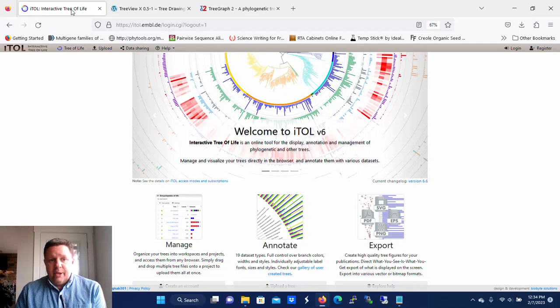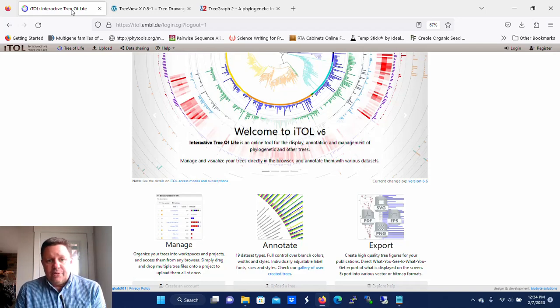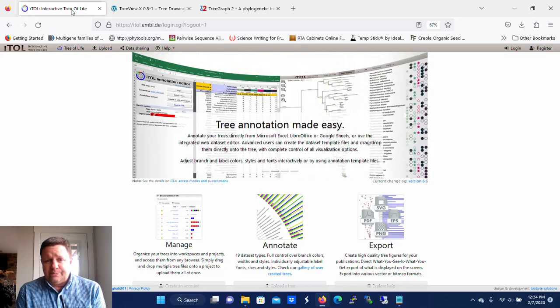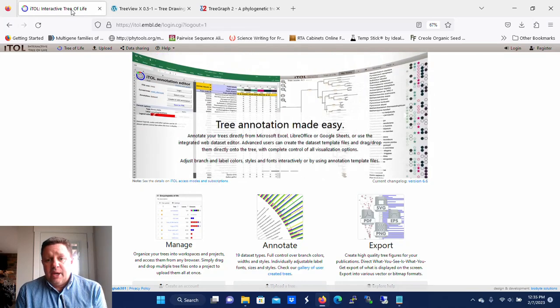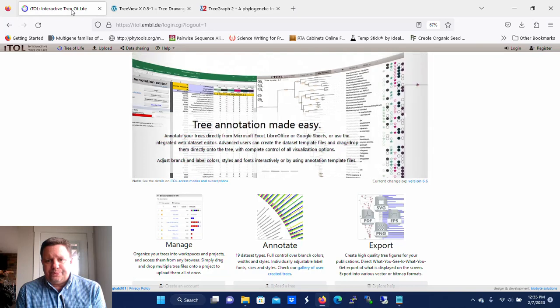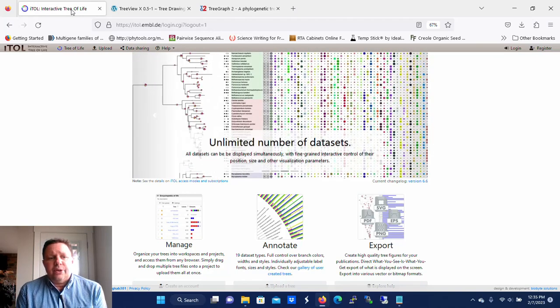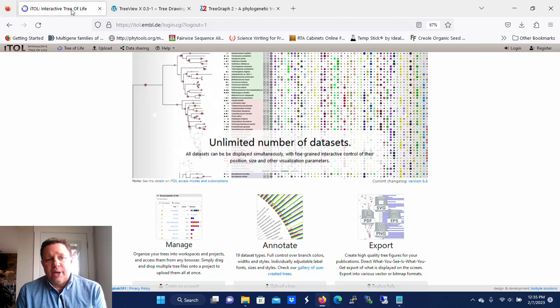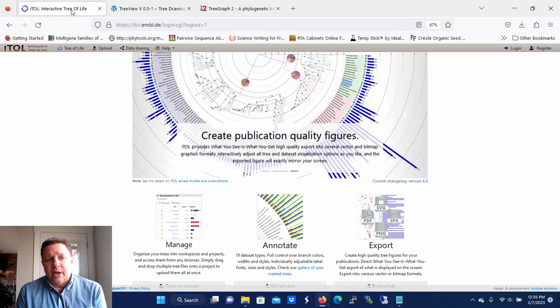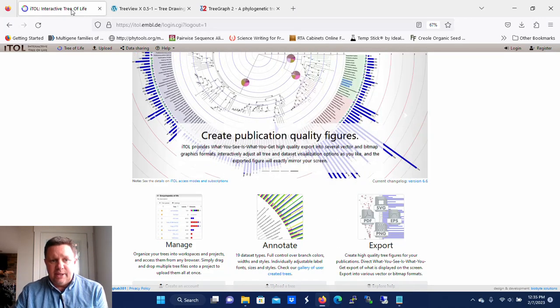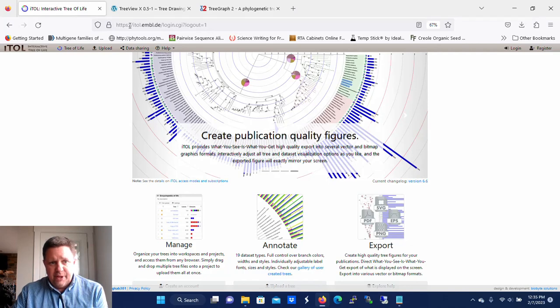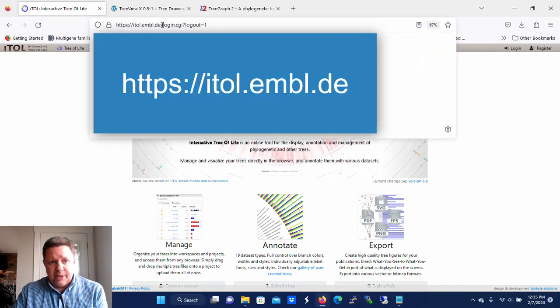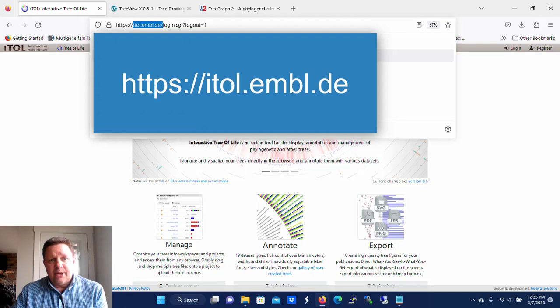Let's start off. We're going to look at how to collapse clades and also how to label clades that you have collapsed or otherwise. You're going to want to go to itol.embl.de, and you can see this website right up here at the top of the page.